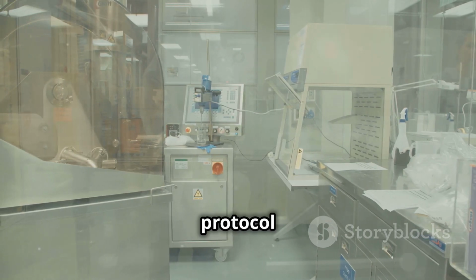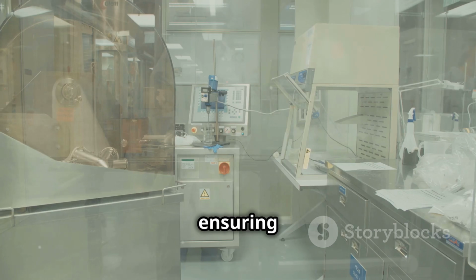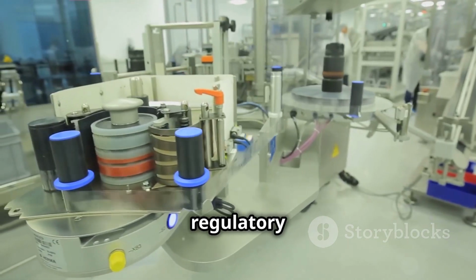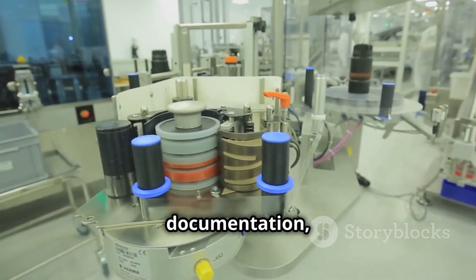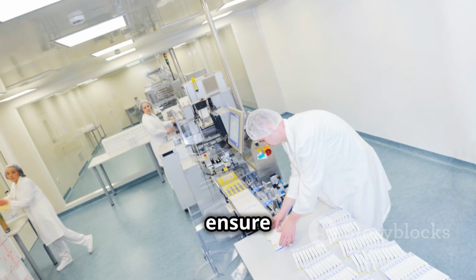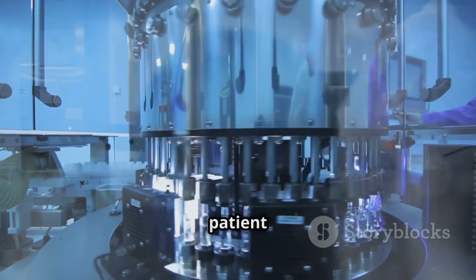This detailed protocol establishes a thorough approach to water system validation, ensuring pharmaceutical-grade water quality and consistent regulatory compliance. The structured documentation, rigorous testing and continuous monitoring ensure that the water system performs reliably, safeguarding product quality and patient safety.